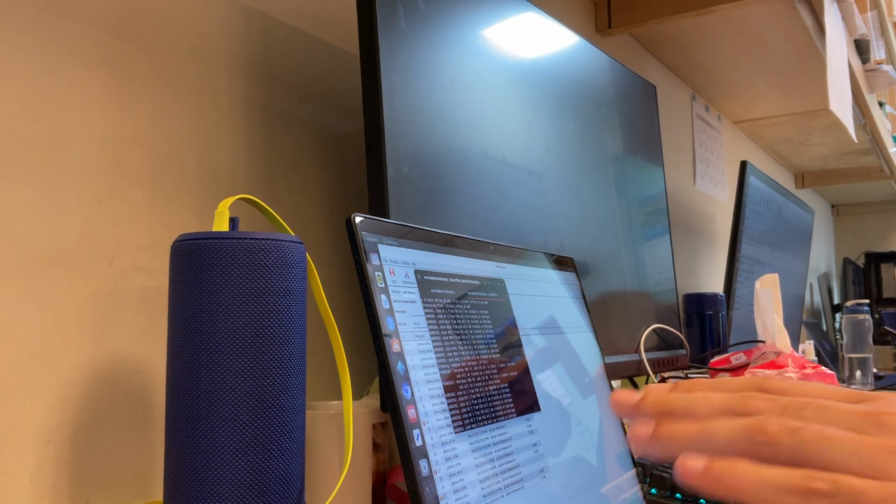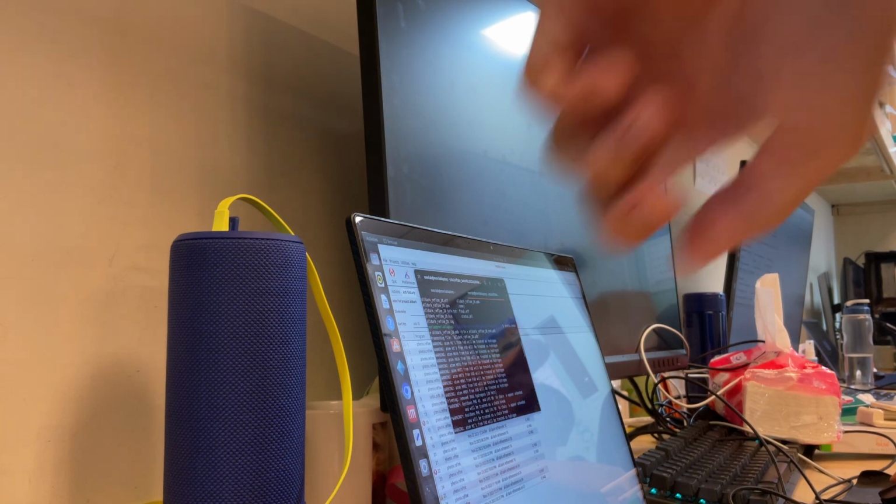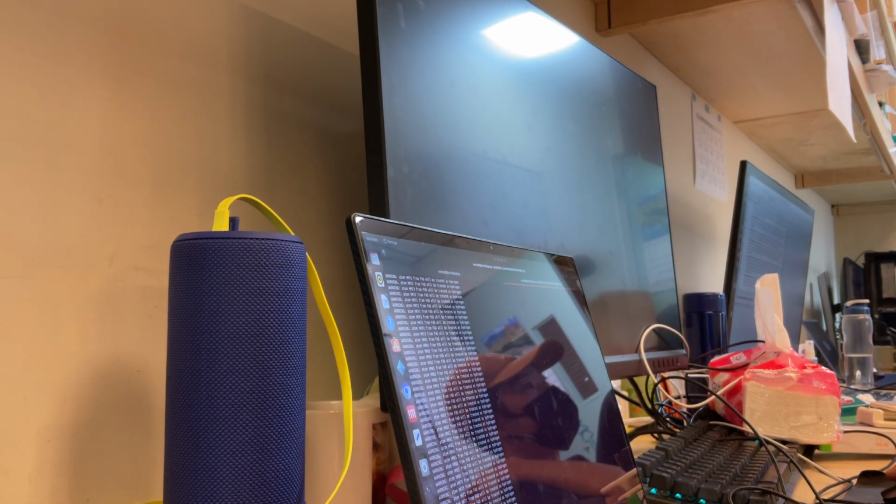Okay, so I run this command. Phoenix reduce all dark refine underscore 28.pdb minus trim, and move that into a new file called all dark underscore refine underscore 28 underscore no H. Just cut out, remove the hydrogens.